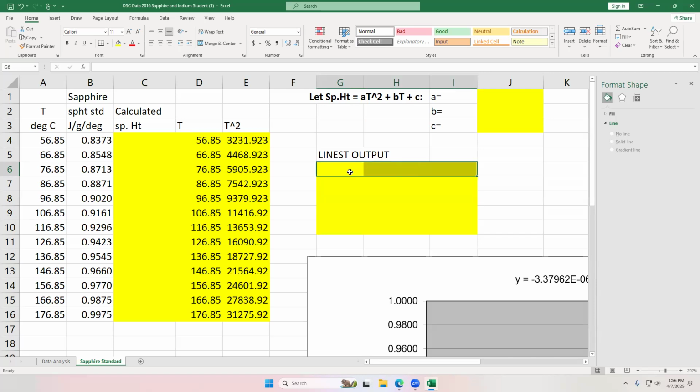One question? No, it's just T squared on the second. Yeah. So 1, 2, 3, 3 columns.